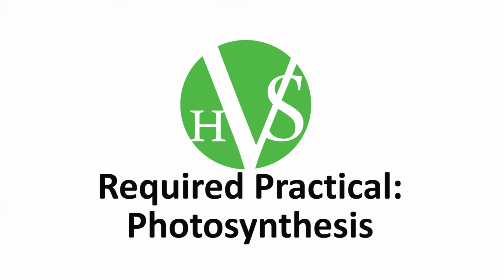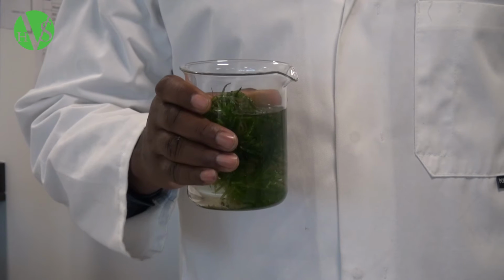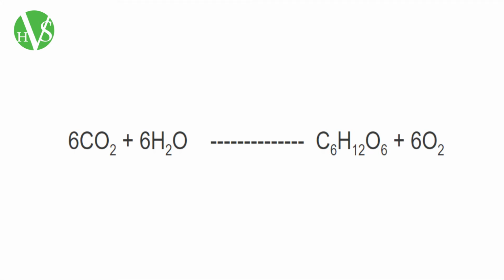This is the GCSE Biology Required Practical about how light intensity affects the rate of photosynthesis in a pondweed. Photosynthesis is a process through which green plants are able to manufacture glucose using water and carbon dioxide in the presence of sunlight. Oxygen is produced as a byproduct.